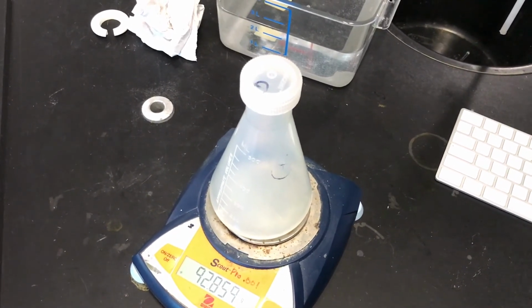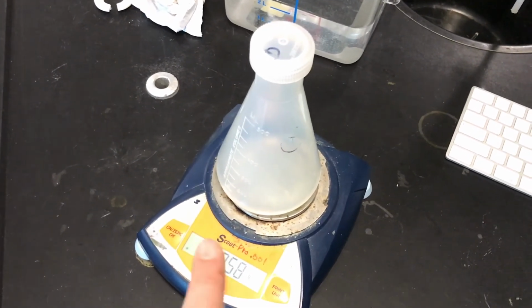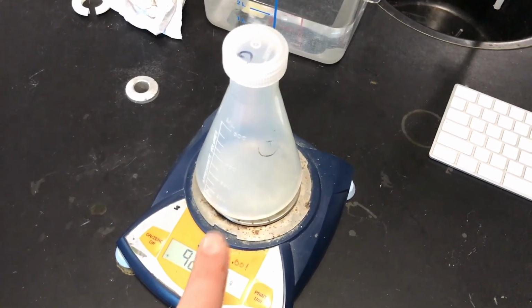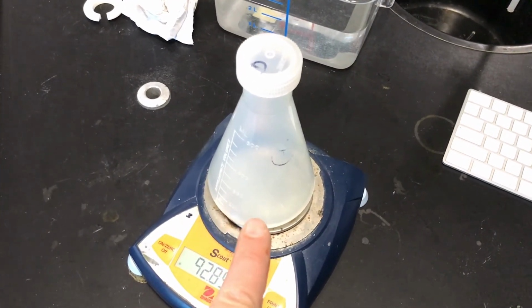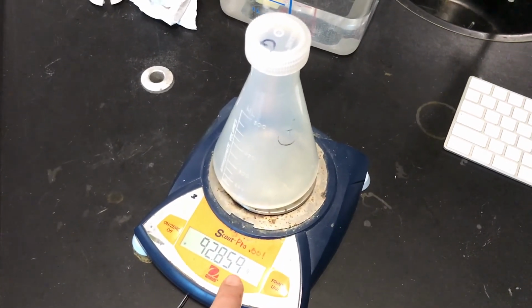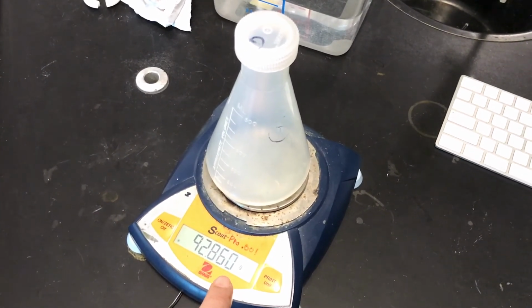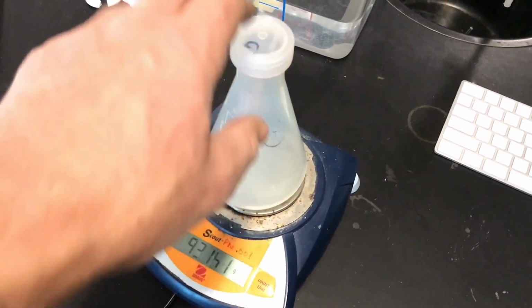So take 1.17 grams per liter and multiply it in this case by 0.516 liters, and you've got the mass of this air. Subtract it from this number of 92.859, and now you have the mass of the dry container. Cool beans.